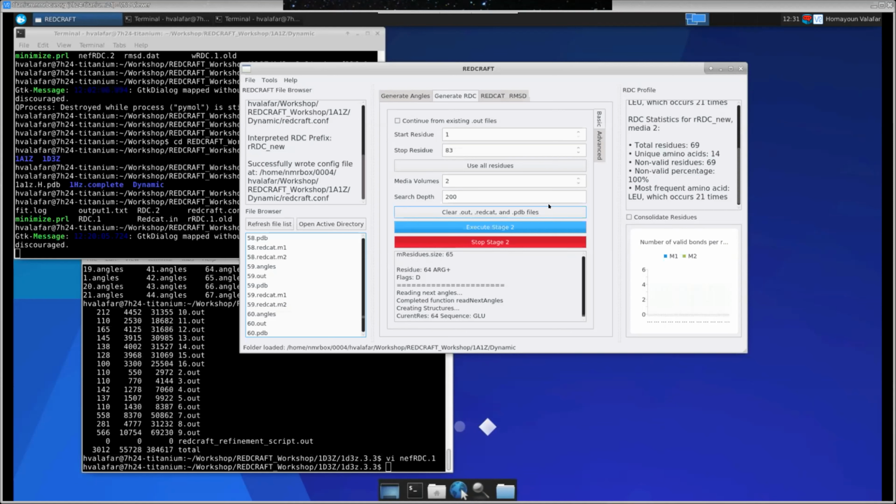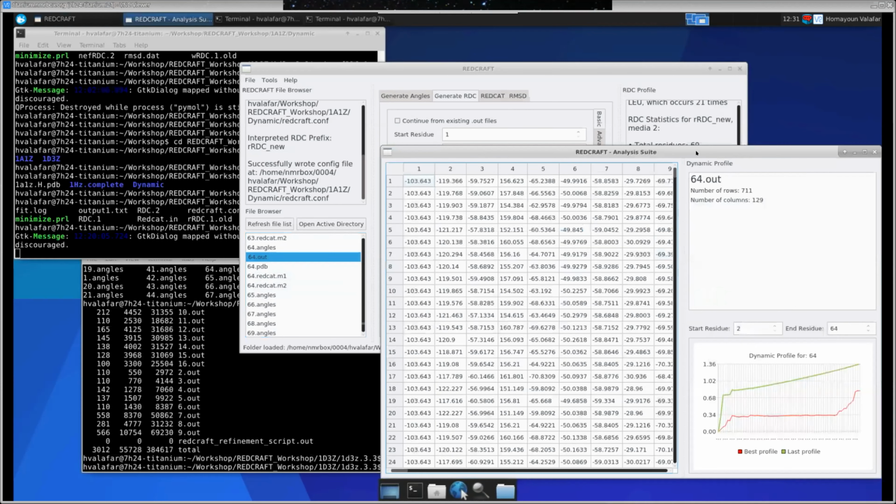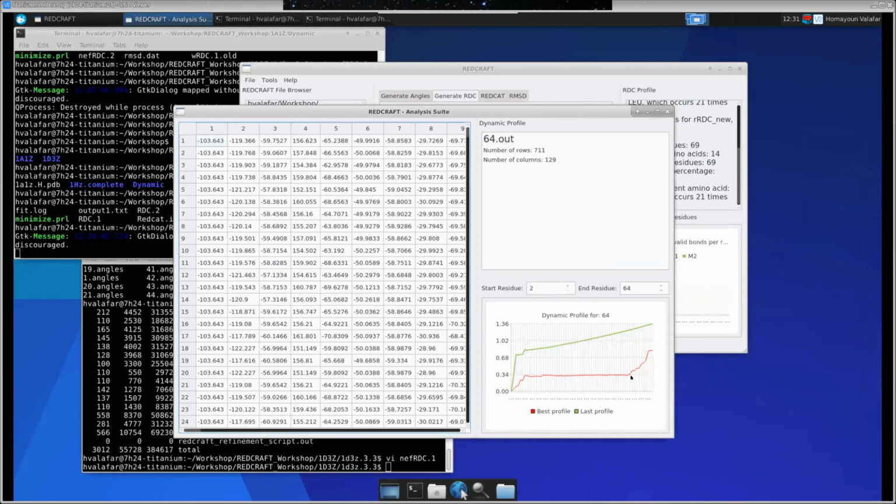If you observe an averaged RDC, if you see an averaged RDC, that's exactly what's going to appear here. Correct. So let me jump into this topic. At this point, what you're going to see is that you can see that it is increasing and then it plateaus. Exactly. Now, I have worked with this phenomenon long enough, and it adheres to theory perfectly.